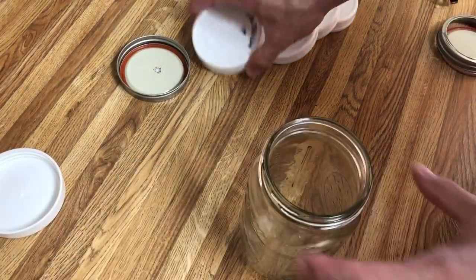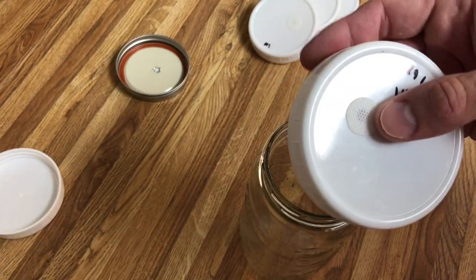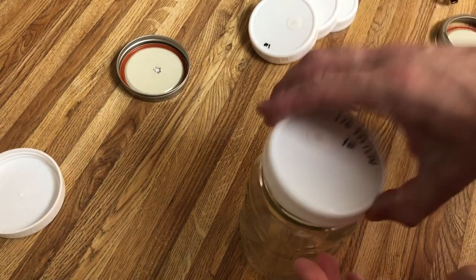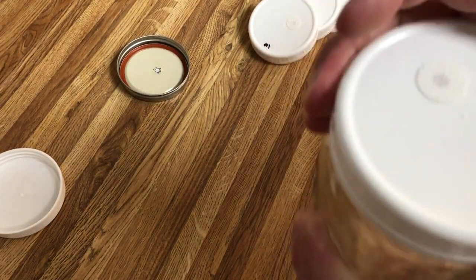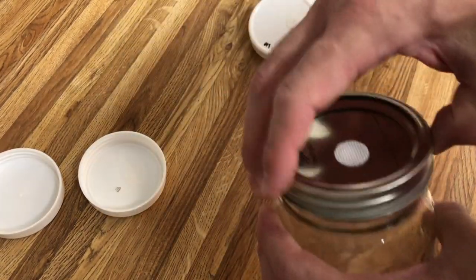The next option is a plastic lid with a filter on it. So these filter discs are from Micropore. You just drill a quarter inch hole and then stick a filter on. This is the best option, in my opinion. You just tighten it all the way. Easy to use, simple. And you can do the exact same thing with metal lids.